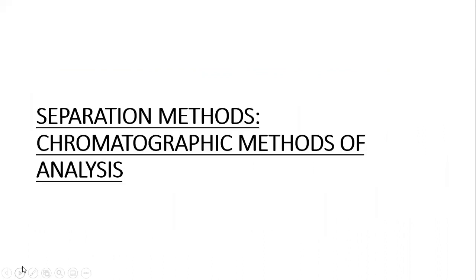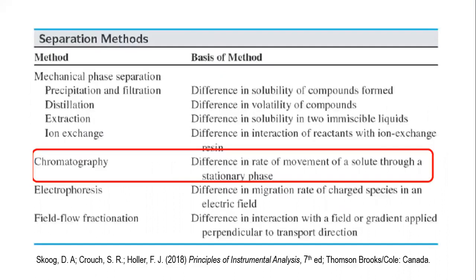Okay, so as I said earlier, experiments 8 and 9 focus on chromatographic methods. And these chromatographic methods are another branch of separation methods. There are other separation methods besides chromatography. So you've encountered this back in your Gen Chem lab classes.